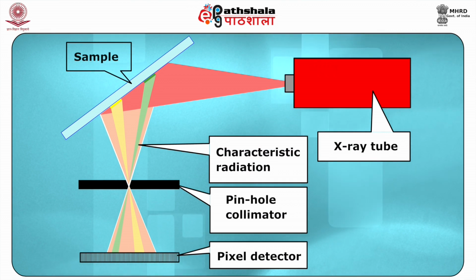In case of X-ray fluorescence, the incident X-ray as well as fluorescent radiation are both invisible to the human eyes, as both the radiation incident and fluorescence lie in the invisible spectrum. But the basic fact remains the same, meaning thereby that an incident X-ray radiation will be of lower wavelength and fluorescence radiation of higher wavelength.